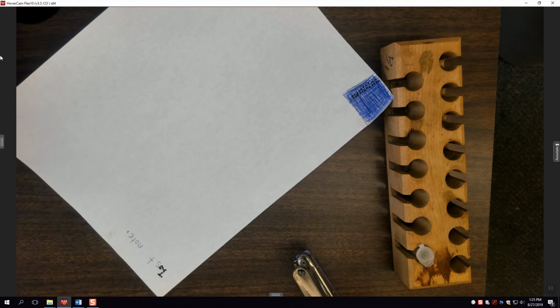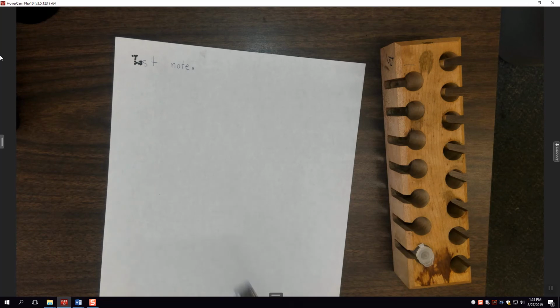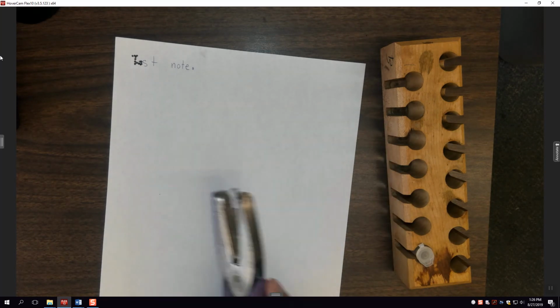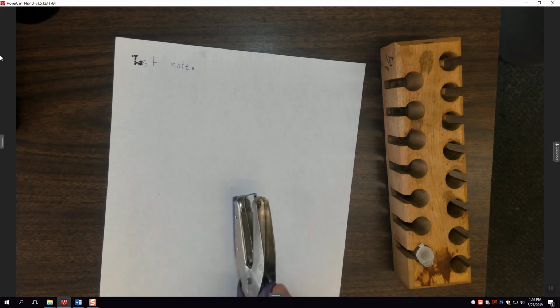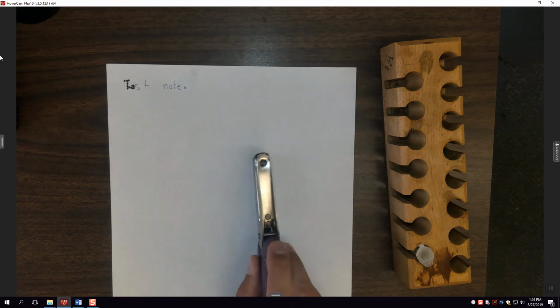If you get to a point where you can't reach any further, you can use your scissors, just cut the paper down a little bit. It does ask you to photograph the evidence before you start to destroy it in this way. So again, get yourself 20 to 30, I'd stick more towards the 30 side, dots of this ink.